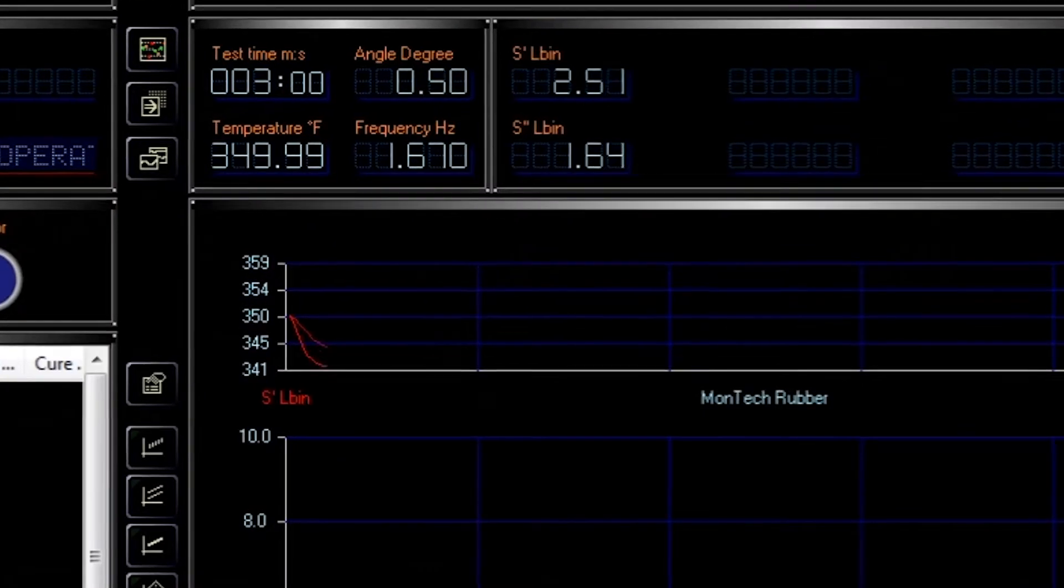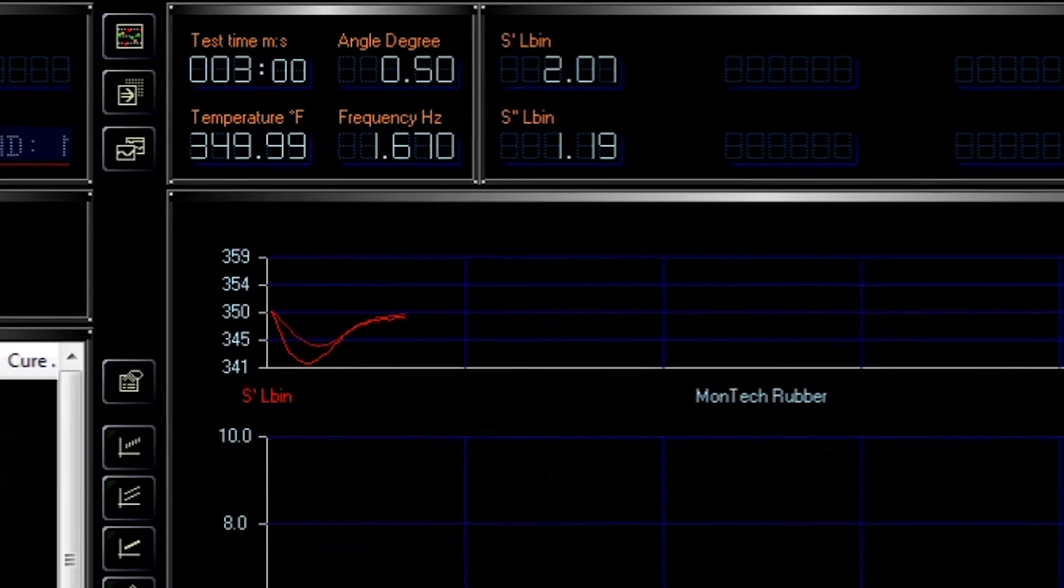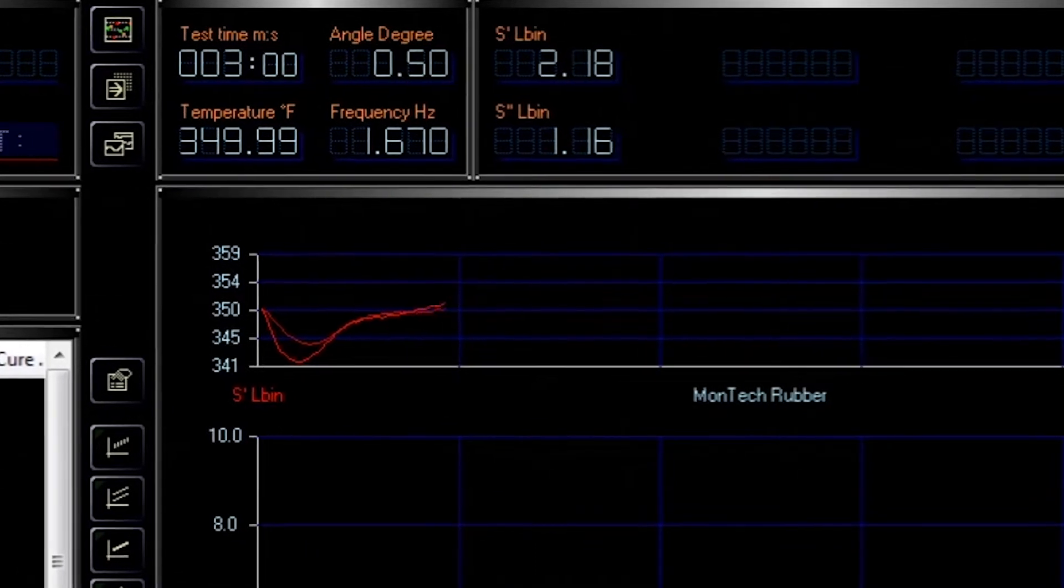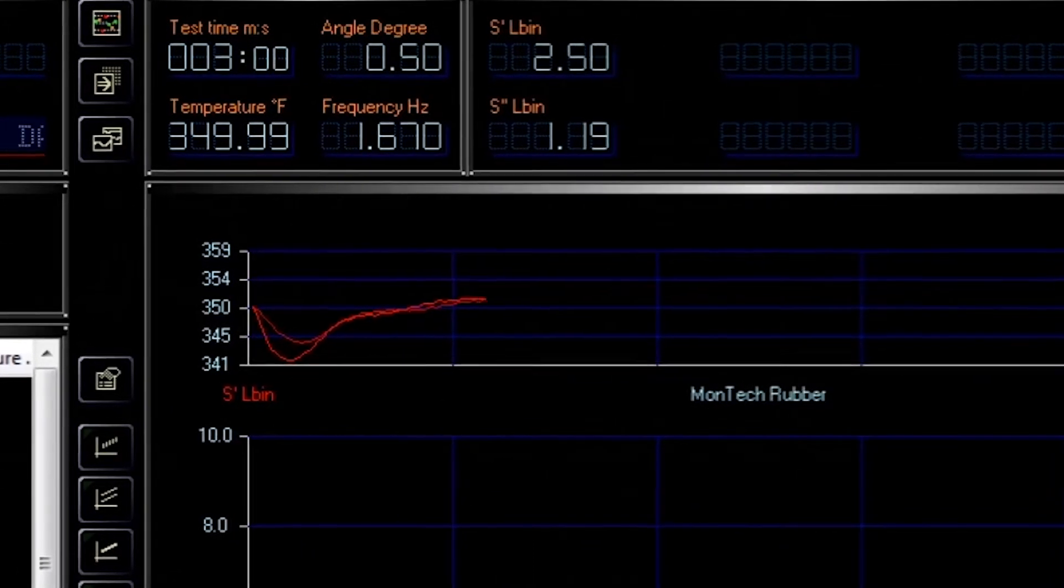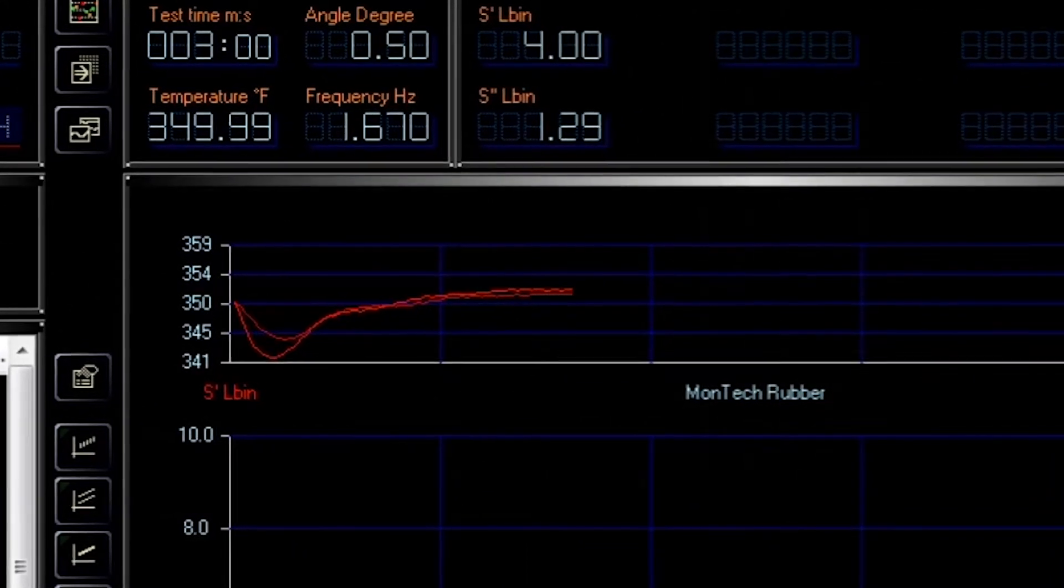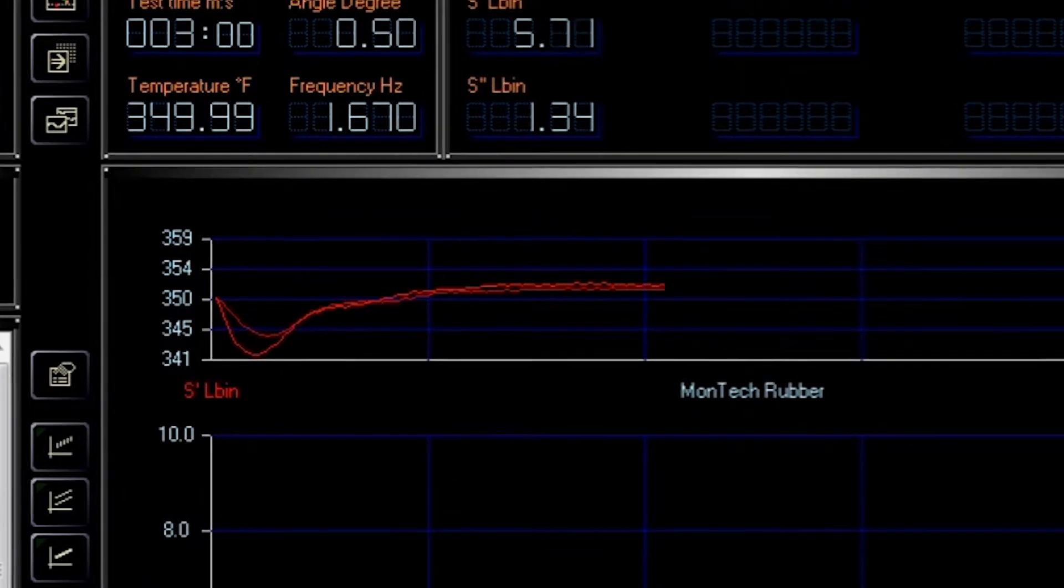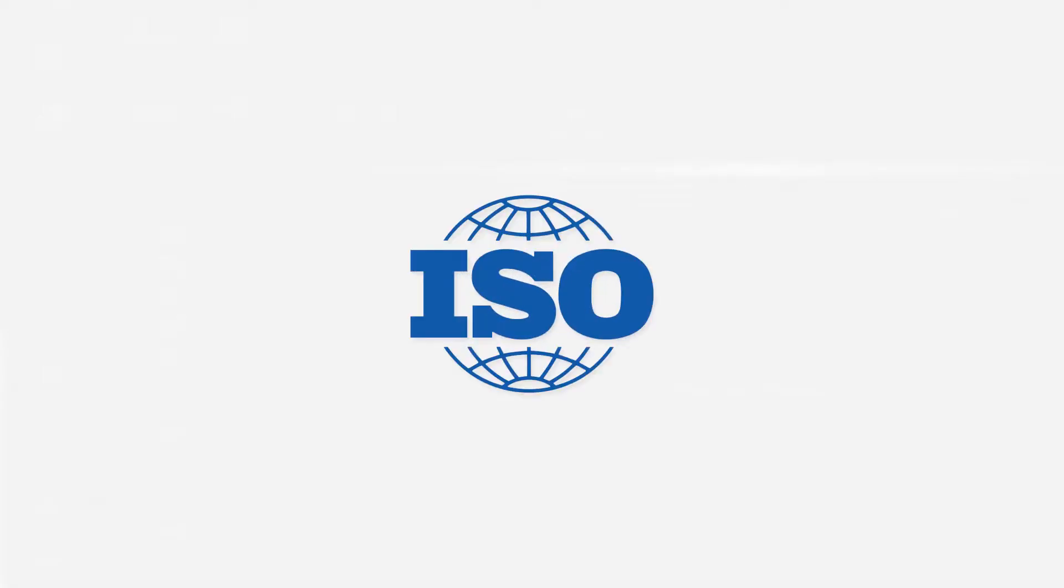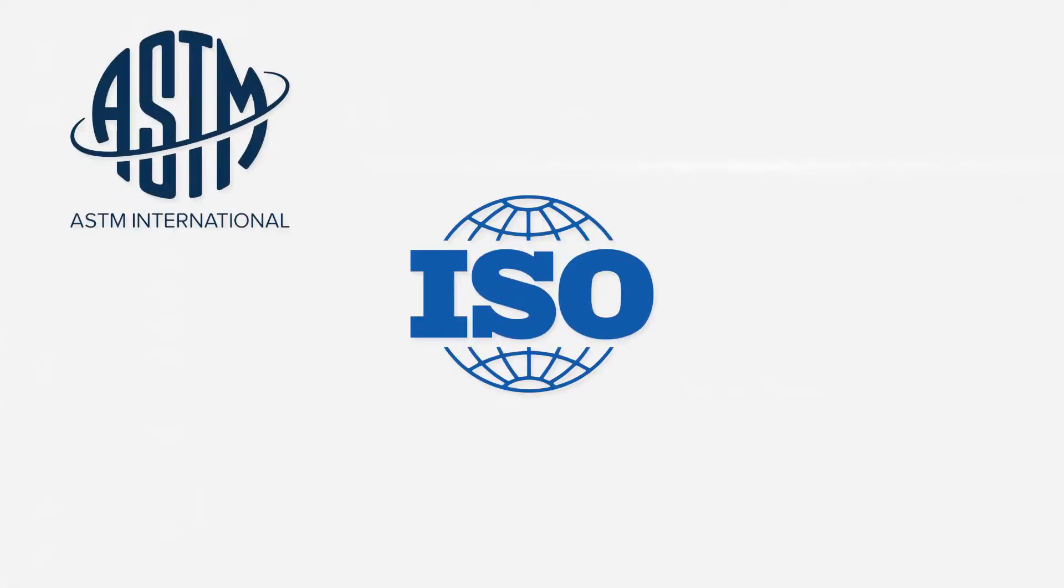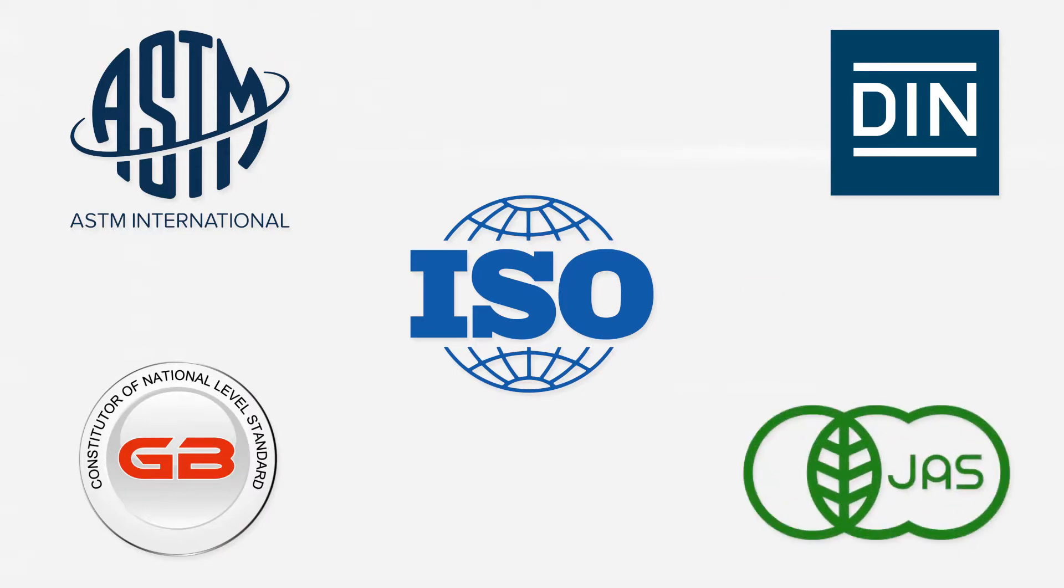During the test, high resolution torque measurements are gathered using an advanced strain gauge torque transducer located above the upper die. The unit meets standards required by ISO, ASTM, DIN, GB, and JAS specifications.